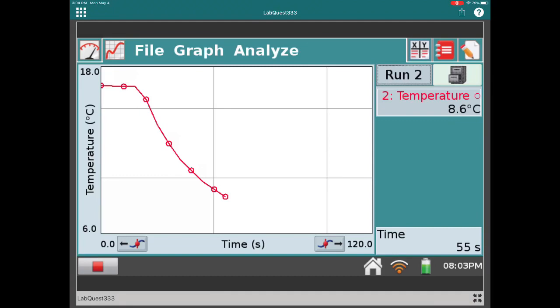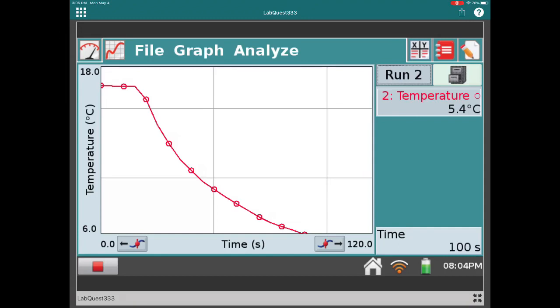See if you can compare the strengths of intermolecular forces between the three liquids we've seen so far. Do the predictions you would have made based on their molecular structures match what we're seeing in these results? The temperature is dropping significantly and I have a feeling it's going to go below the minimum on my graph — so at the end of the experiment we'll rescale the graph. Are you able to explain why the temperature is dropping? Why does the evaporation of a liquid lead to a drop in temperature? Is evaporating endothermic or exothermic, and why?